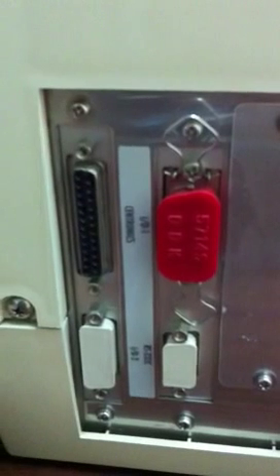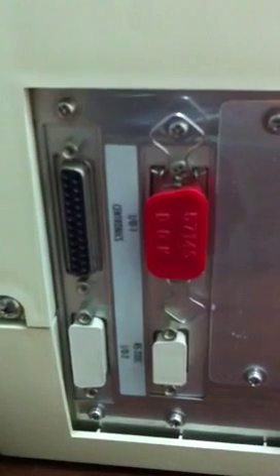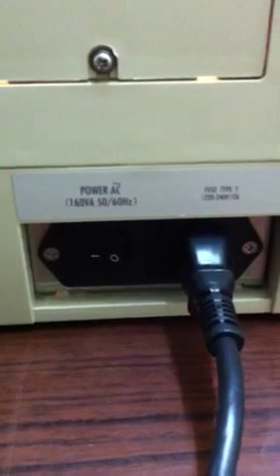These are the outputs. A direct LPT port which you can connect the printers and RS-232 to connect it to the computer. Power input, on-off button.